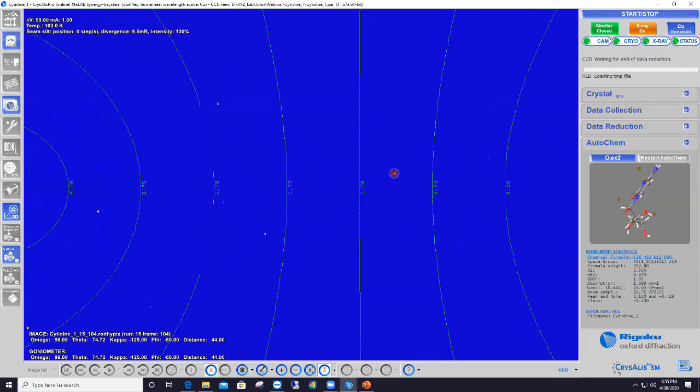So this is the HyPix-Arc 150, and it covers 150 degrees in one setting. It is our high-end detector for the home lab. Thanks. So do you remember the Rapid at all? That was a curved image plate detector, and this detector uses the same sort of technology in the sense of you curve around the sample to collect data more efficiently. Okay, thank you, Doug.